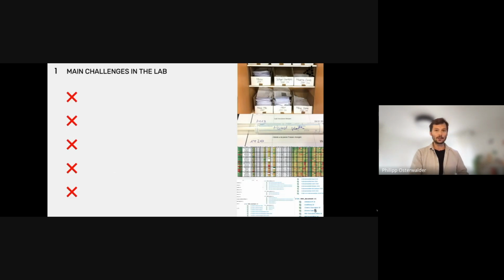So directly, let's hop on to what we face at OneLimbs every day in some labs. There are a variety of different kinds of laboratories. The laboratories we use for lab automation are probably not about high sample throughput, but more about routine workflows, instead of copy and pasting, or even some value-adding workflows, which can also be automated.